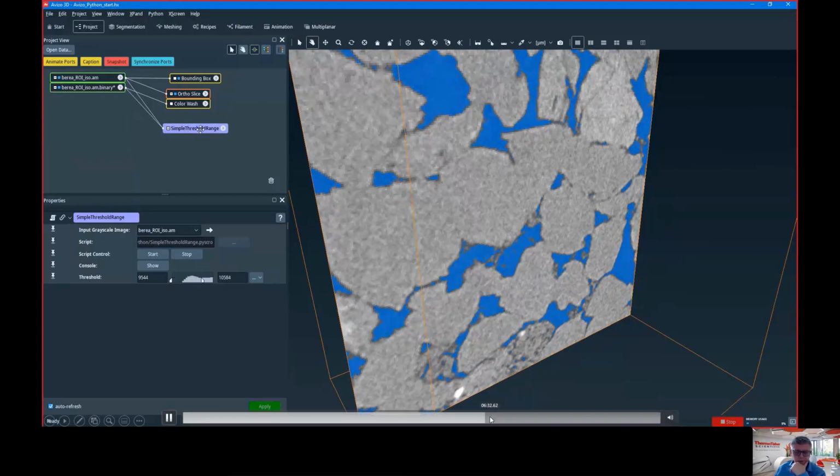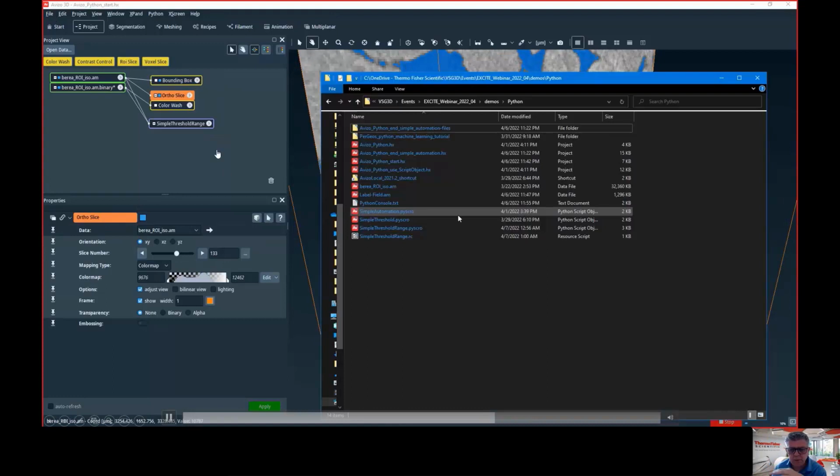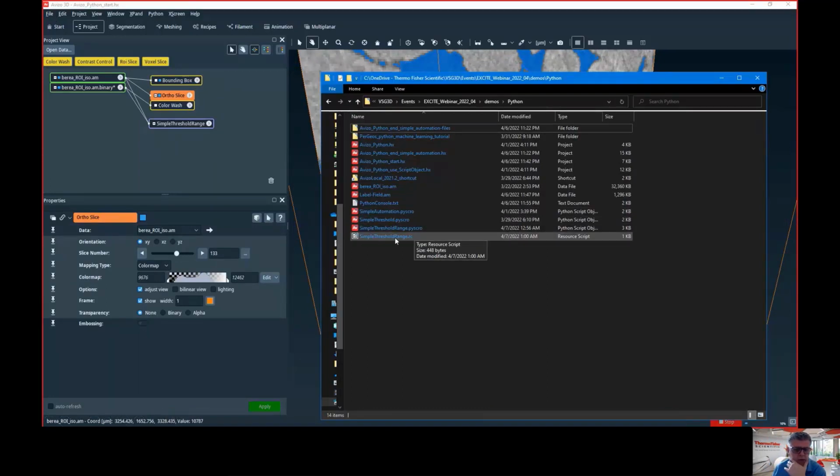Okay, I say Avizo, but I guess the point could be PerGeos. When we speak about Python, Avizo and PerGeos are 100% the same.